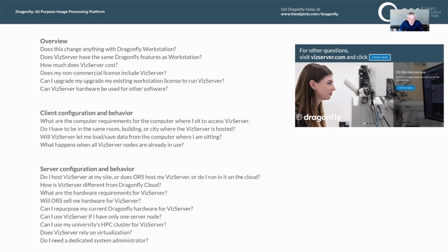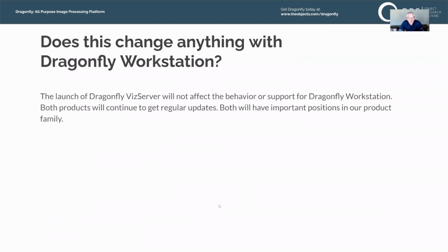But if you have other questions, I encourage you to visit VizServer.com and click on Contact Sales. When you go there, our sales team will respond and deal with all of your questions on a one-on-one basis. We'll set up a seminar or webinar to discuss it with you and your site. So I'm going to start this discussion in this overview topic, and then we'll go through some questions on how it is configured and behaved for the client, and then finally how it's configured and behaves for the server.